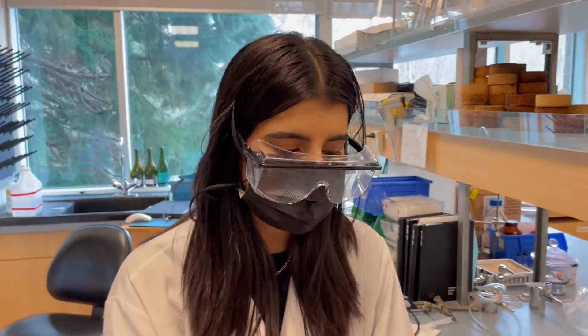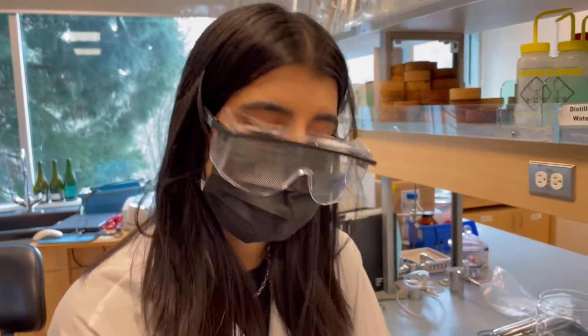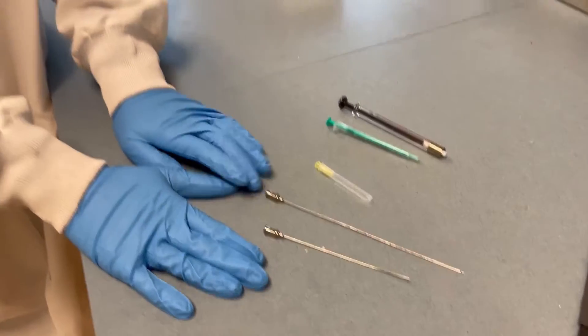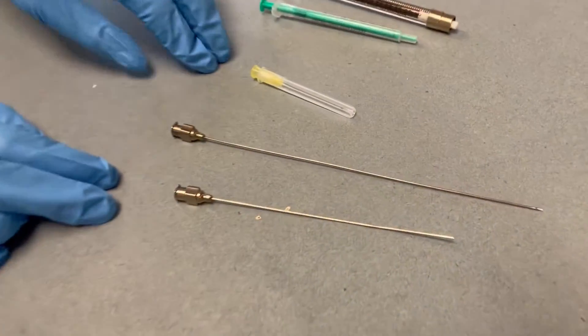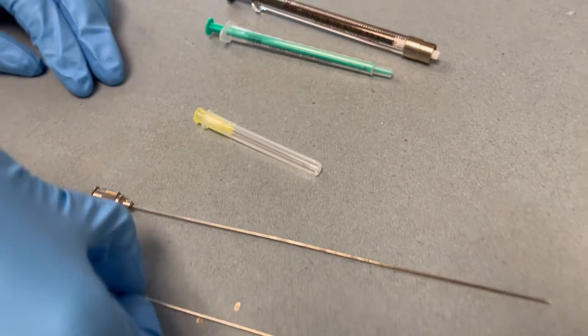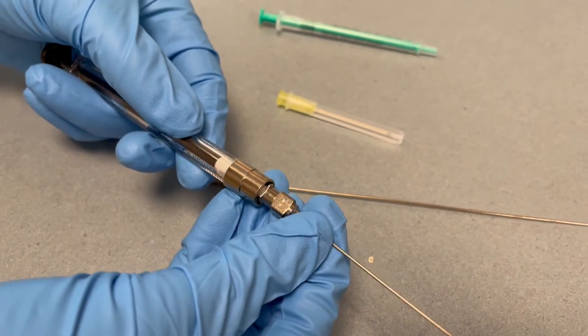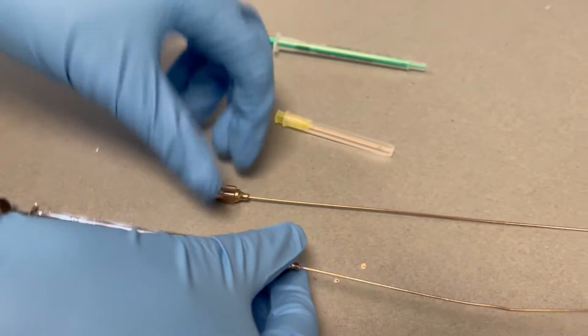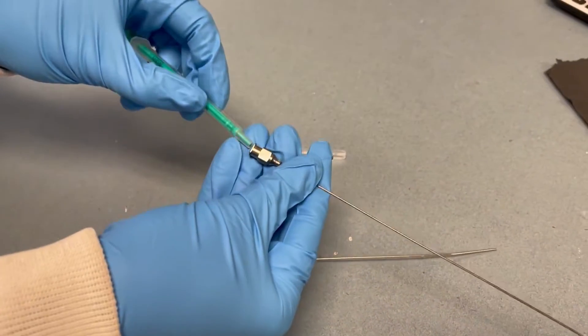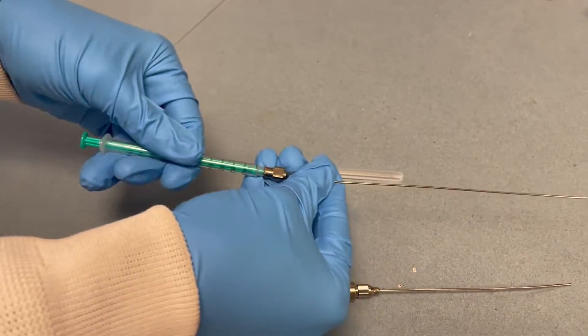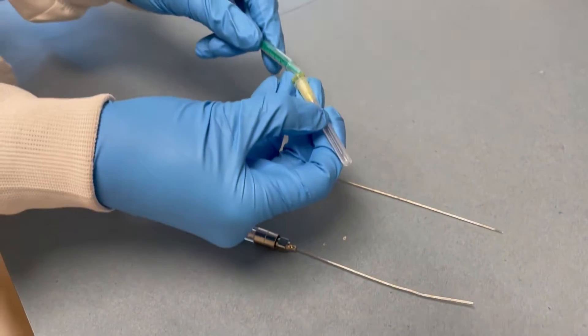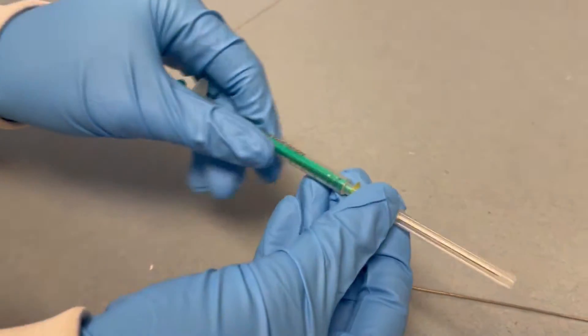We often use needles in this lab and today we'll be talking about their safe handling. We either use reusable stainless steel or plastic disposable needles. Both have these luer locks that can be twisted onto Hamilton syringes or simply pushed onto the plastic ones. The plastic needles are the same way.